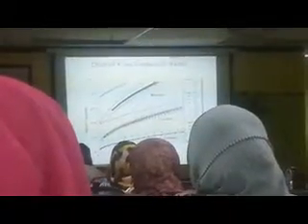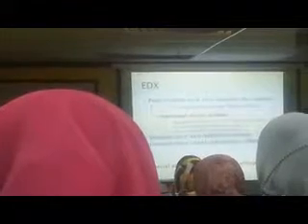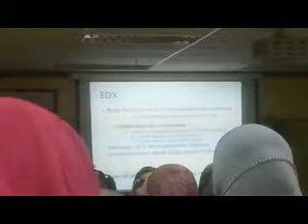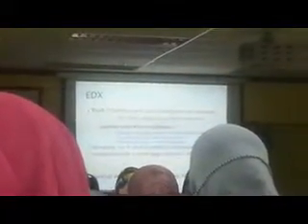You understand? So simply because you find a peak somewhere which matches with some K alpha of something, it doesn't mean it is that element. The best idea is to find out if L alpha is there, to find out if M alpha is there. You understand? For example, if L series is indicated, K must be there. Because K, L, M, N, right? If N is there, the bottom ones must be there. If that is missing, it means your identification is wrong. If M series is indicated, then L series must be present.